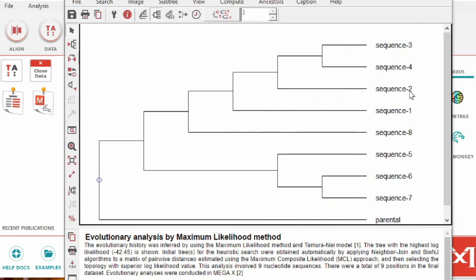And now we can see 1, 2, 3, 4. Okay, this comes together relatively okay-ish. So 3 and 4 together. Then in this group, sequence 8 grouped together with 1, 2, and 3 instead of with 5, 6, and 7. Also 7 and 8 should be together, but they are not. And 5 and 6 should be together, and they are not. You see the devastating effects of the missing information.